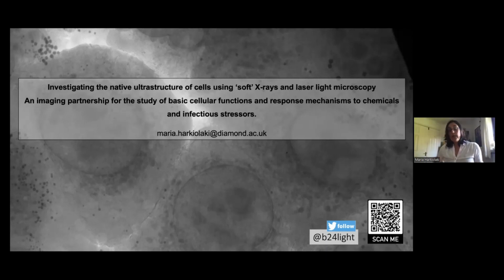So we either collaborate and prepare samples, or people send us their samples. We can grow the cells and plunge freeze them at a certain time. And then you have the remote collaboration. Ideally, though, if somebody comes to us and we teach them how to do it, we share our expertise, we share the facility, we share our consumables. And then at least you have one person that can independently go back and see the technique there.